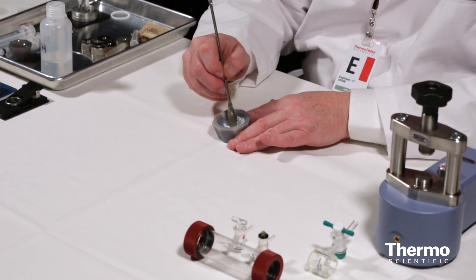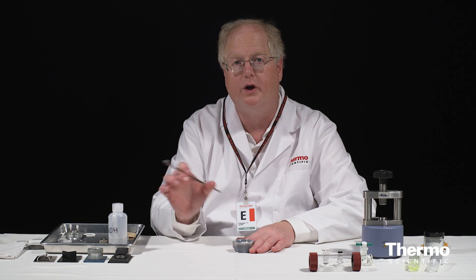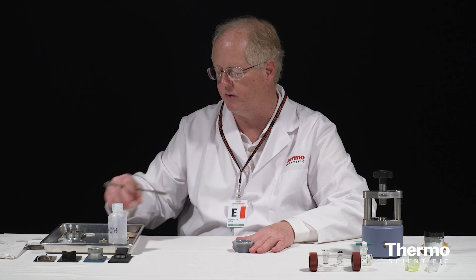So you can see now I've got something that looks almost like dust — it's been ground down. Now there are tools that specialize in this, something called a wiggle bug that actually sits there and shakes the sample with a little ball in it and will grind it up even more finely. But this is quite adequate for what I want to show.